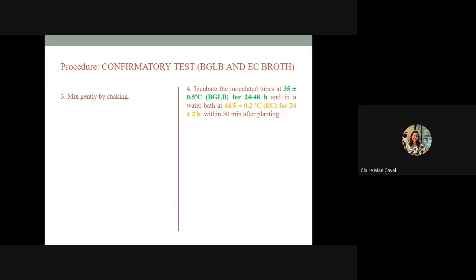For total coliform, that is 35 degrees Celsius. Fecal coliform, 44.5 degrees Celsius. For E. coli specific detection in the membrane filtration technique, the temperature requirement is biphasic. First is the temperature acclimation. That's what it is called. First it needs 35 degrees Celsius for 2 hours to rejuvenate stressed bacteria, and then we extend it at 44.5 degrees Celsius for 22 hours.